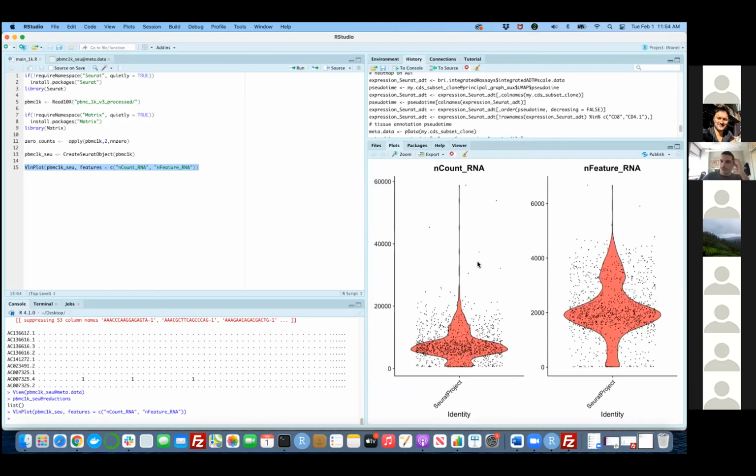So how do we interpret this? What I'm seeing is that mostly the cells have maybe some 6,000, maybe 7,000 UMIs in total, right? Some of them slightly higher, but I can see that some cells over here have a lot of UMIs, right? So going back to Drop-seq, it is possible that you accidentally suspended multiple cells in the same droplet.